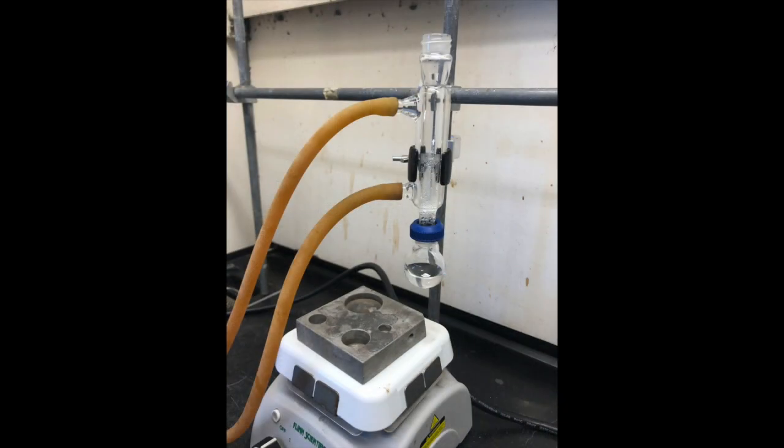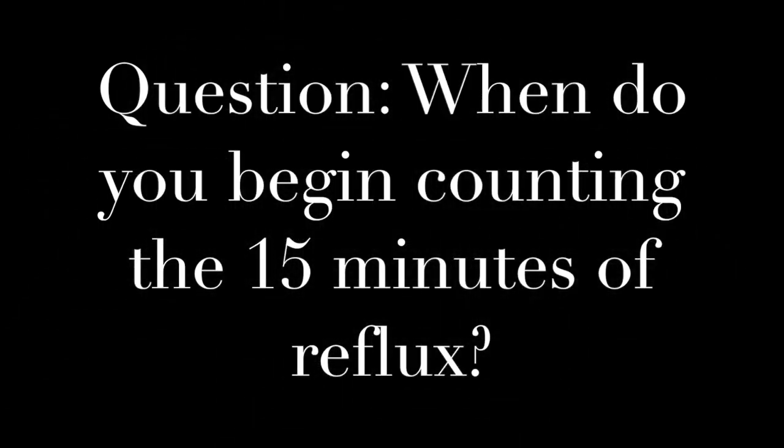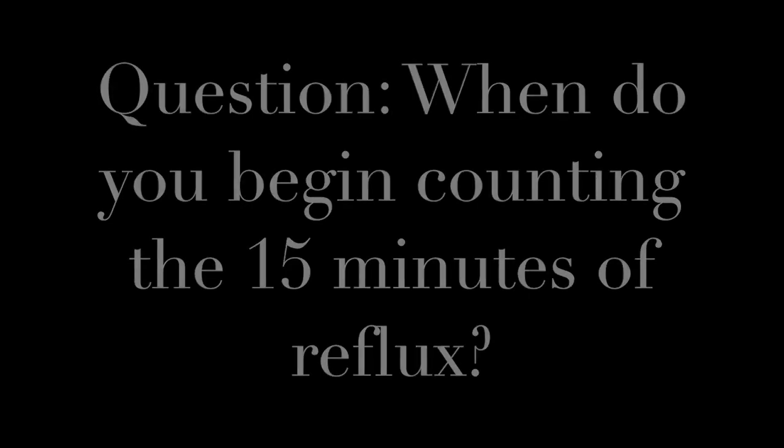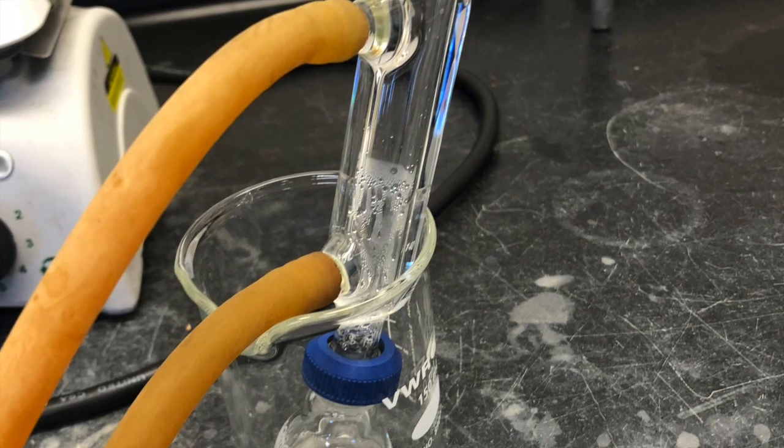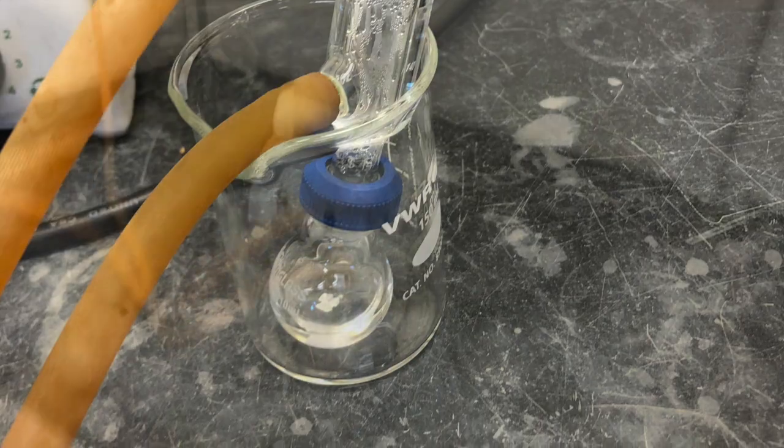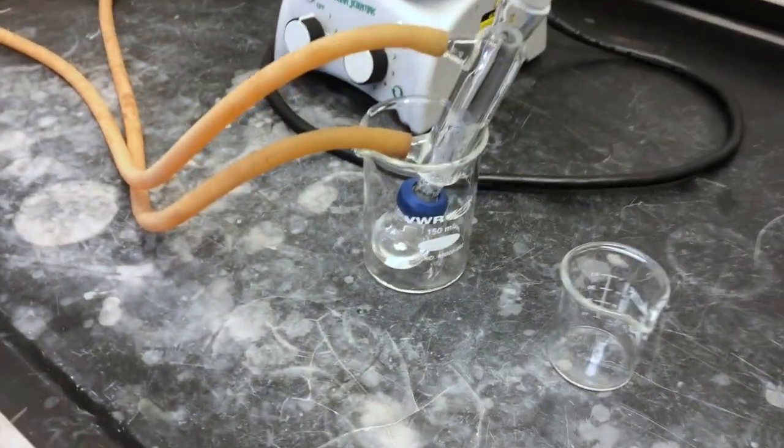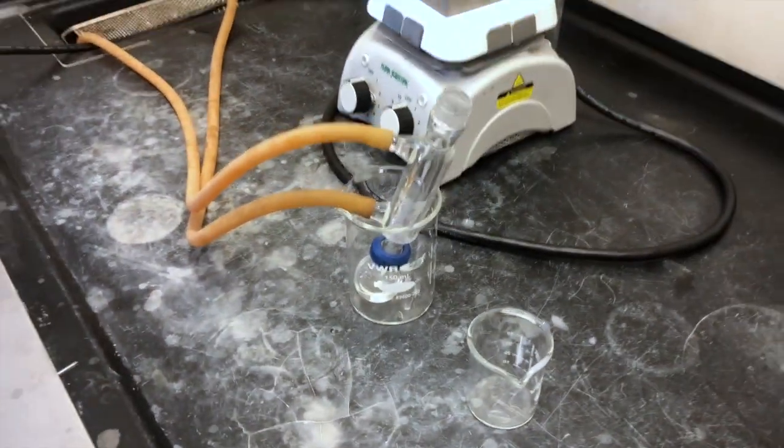After 15 full minutes of refluxing, we began to dismantle the apparatus. As soon as the heat was turned off and the flask was cool enough to touch, it was removed and placed into a beaker so it wouldn't fall over.